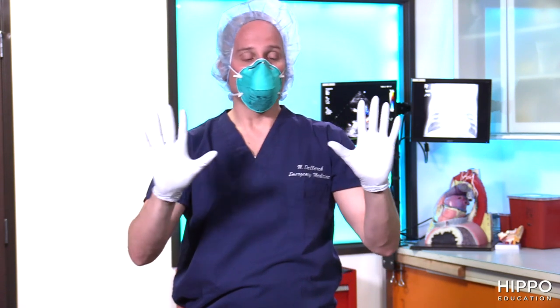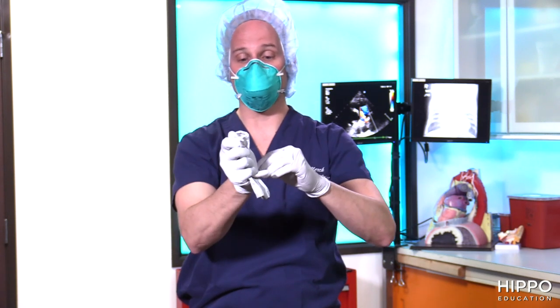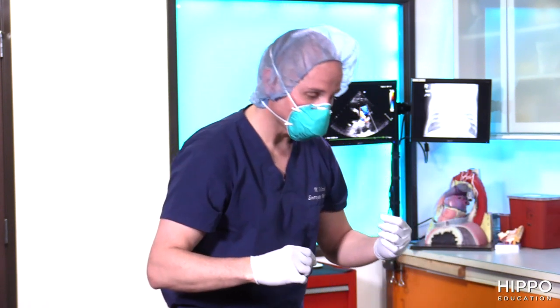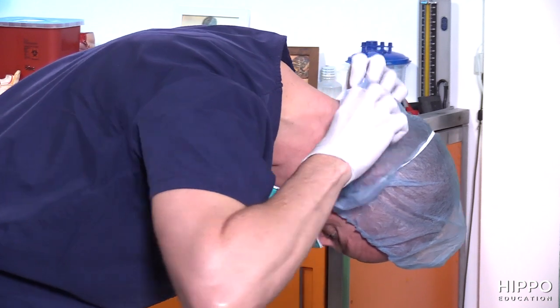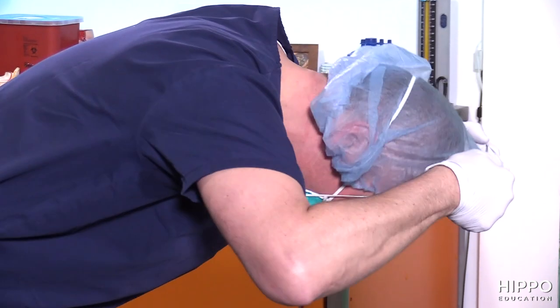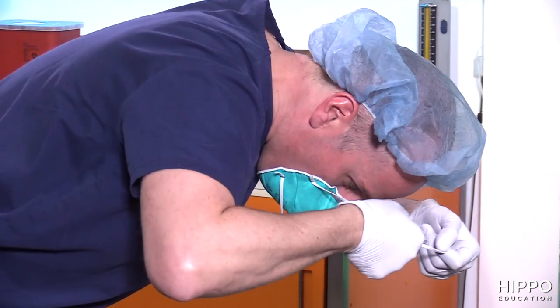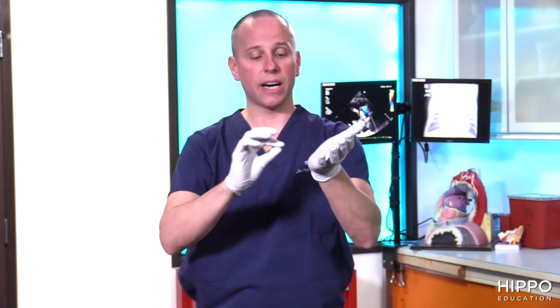The next step is going to be removing the face mask. You're going to repeat hand hygiene after you've left that room, because you may have touched the doorknob or whatever when exiting. And you're ready now to remove the mask — grabbing the lower strap first, pulling the lower strap, then grabbing the upper strap and pulling that off. Throw away your mask, remove your hair bonnet if you're wearing one, and then the final hand hygiene step.